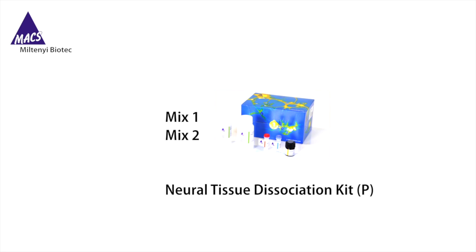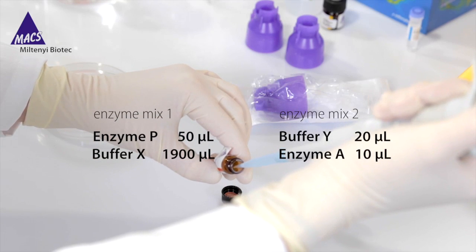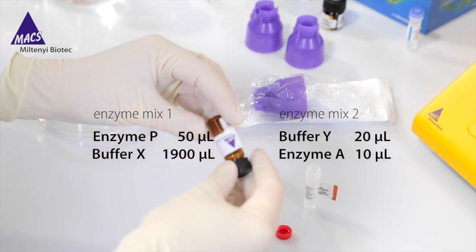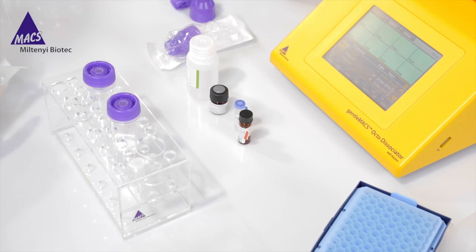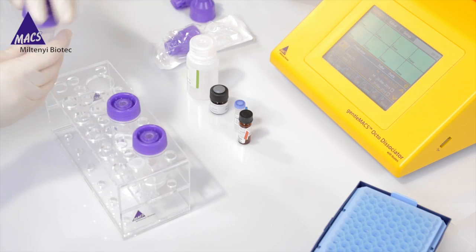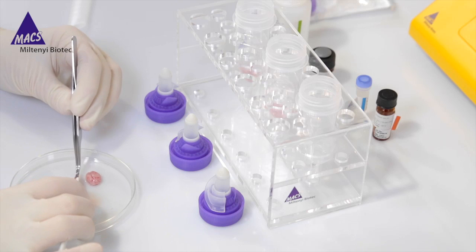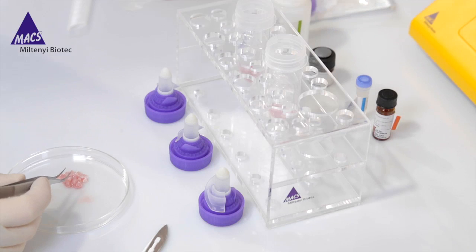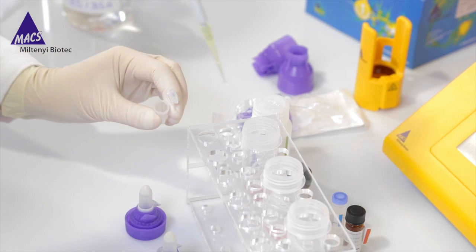The GentleMACS Dissociation Kit contains the components for two enzyme mixes, mix 1 and mix 2. You have to prepare mixes 1 and 2 by combining the components as shown, but first re-suspend the lyophilized enzyme A powder by adding 1 milliliter of Buffer A. Do not vortex. The solution should then be aliquoted and the surplus can be stored at minus 20 degrees Celsius. Transfer the appropriate volume of enzyme mix 1 into the GentleMACS C-tubes.